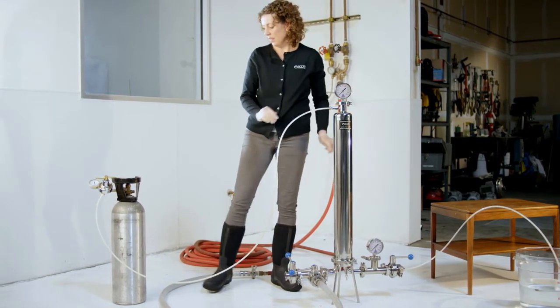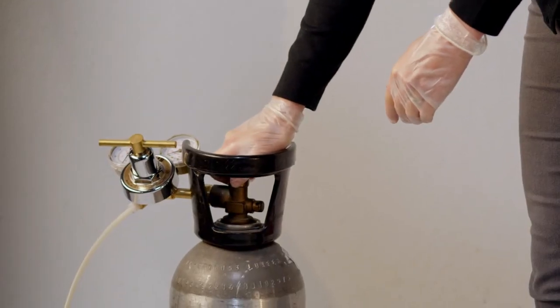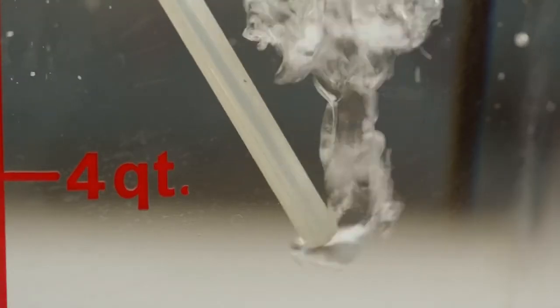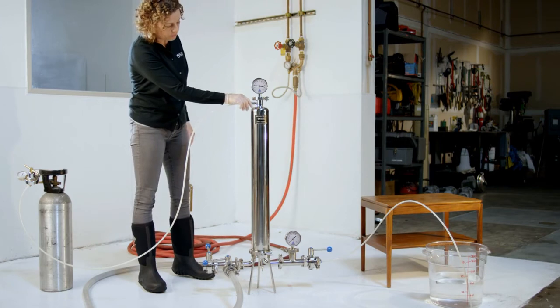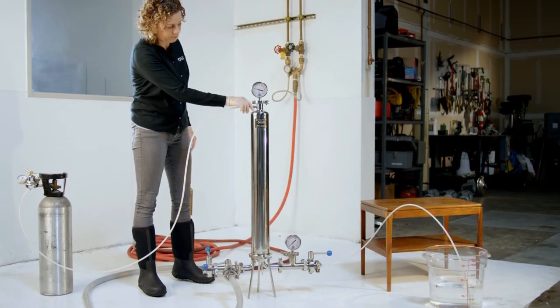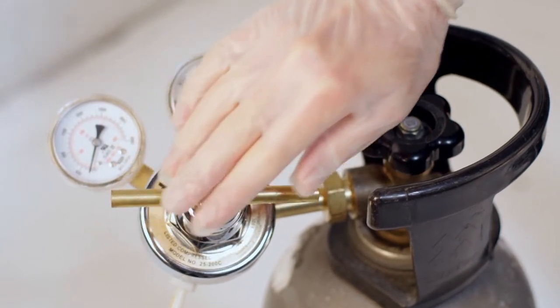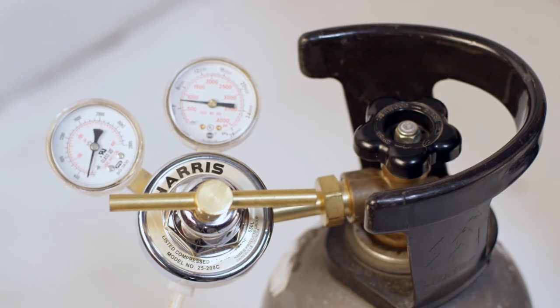Gradually increase pressure on the compressed gas regulator from 0 to around 5 psi or 0.3 bar. You will immediately notice a rush of water through the discharge hose into your bucket. This is the residual rinse water in the housing that may not have drained.